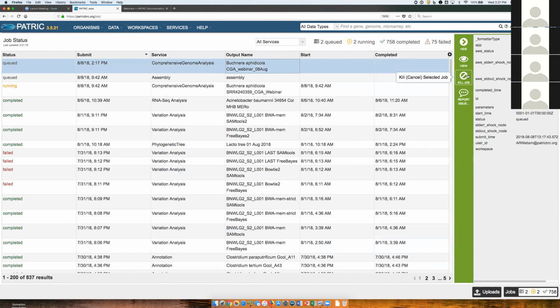I can kill the job. This happened to me just the other day. I submitted a job and then realized, oh no, I put in the wrong taxonomy. So I came in and quickly killed the job. This is the only time you can kill the job. Once the job is completed, it's on your jobs page forever. But this is the most important one.